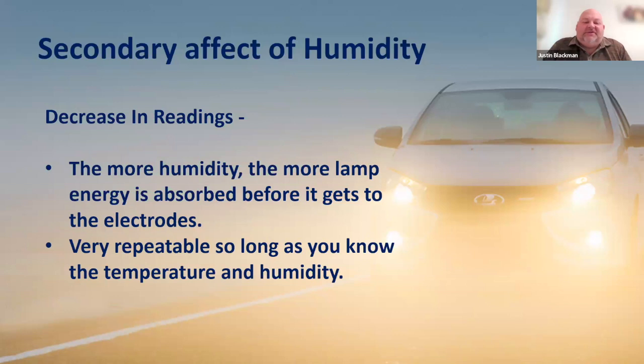real world readings don't come with completely dry background air. They come with all mixtures of humidity going on. Now, the problem is that as we get higher humidity mixed in with our VOCs, that humidity will actually absorb the energy being produced by the lamp in the detector, and it stops some of the energy ever reaching the electrodes and the intended gas it wants to ionize. So we just lose signal before we even get to make a signal.